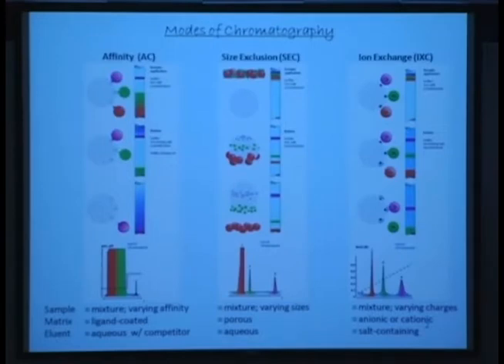Sulfated carbohydrates tend to be associated with an even higher proportion of water. So, depending on the size of the molecule, certain molecules will be excluded and they would come out at an appropriate time. So we are, in essence, using a technique of separating molecules for the most part according to size. And this relationship can really be exploited to determine the molecular weight.